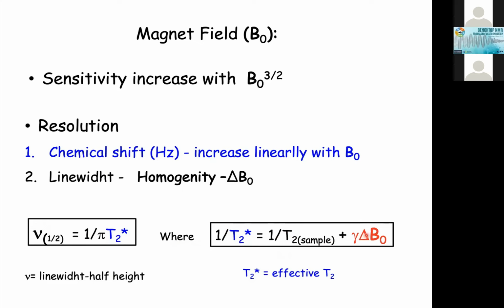And for these two benchtop equipment that we will talk about later, this contribution here could be minimal for medium resolution or intermediate resolution NMR, but for low resolution, this term here is so big that almost 100% of this decay here depends on the magnetic field.